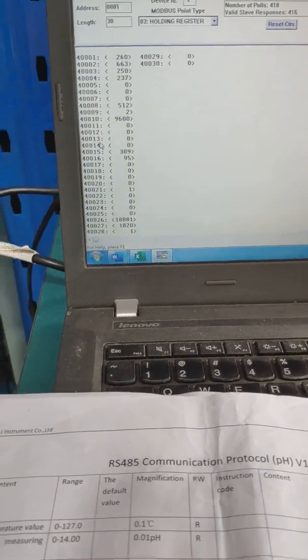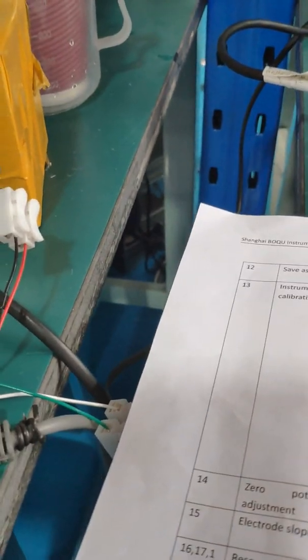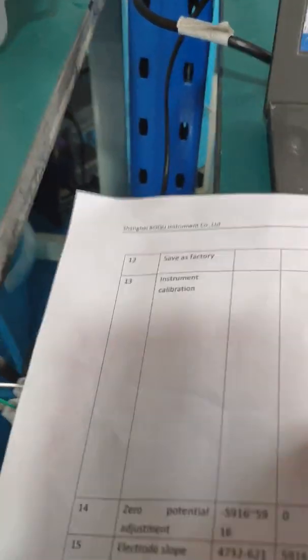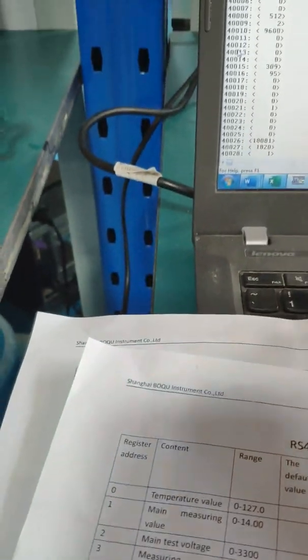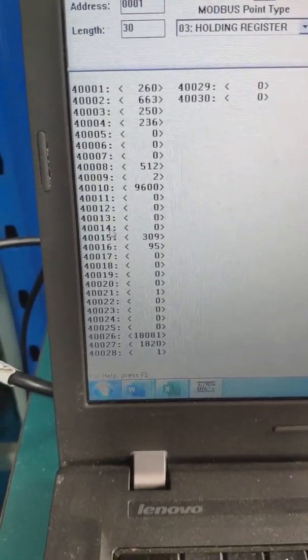Now we start the calibration. Register 13 is for calibration, and register 14 is also used here.